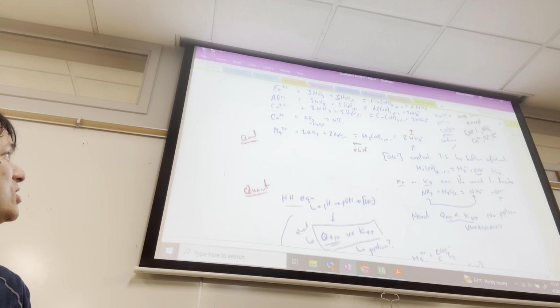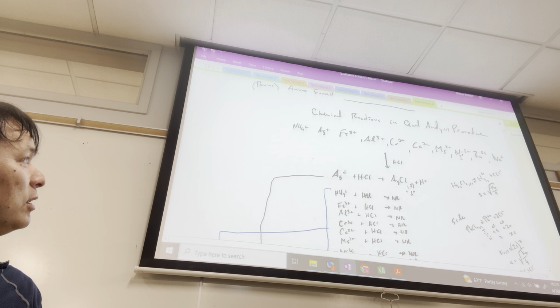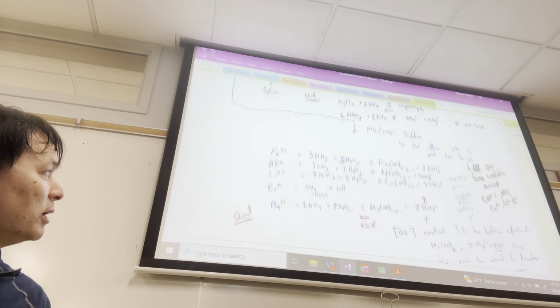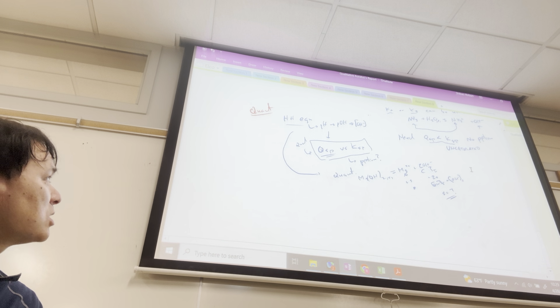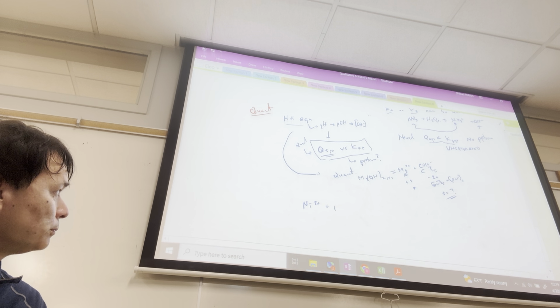Well, that's magnesium. What other 2 pluses do we have? The other 2 pluses that we have are nickel and zinc. Both nickel and zinc form insoluble hydroxides. They're not the exception. So, for example, for nickel, we have to do the same thing. And for your report, you would just do this qualitatively. So this is what you'd write.